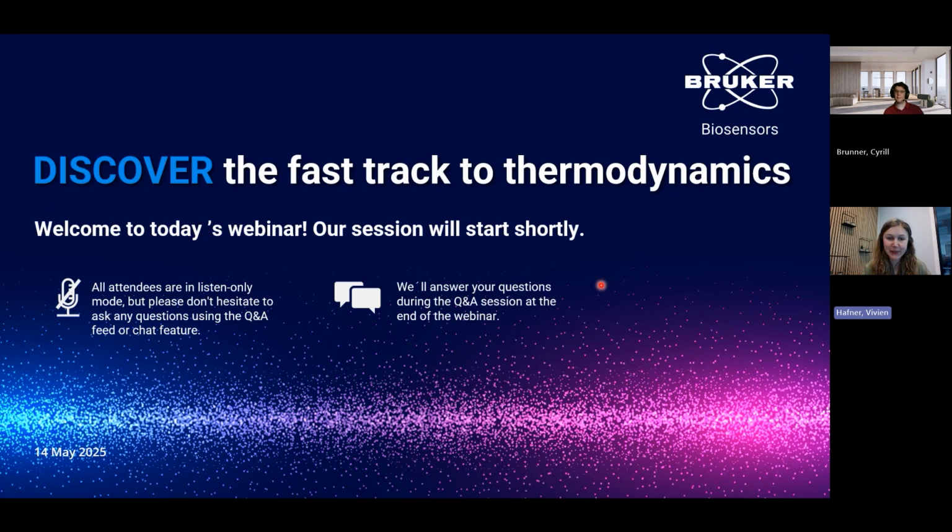Each month, we explore a different molecular interaction, discuss its challenges, and discuss ways of analyzing it. Today is a very special episode of this webinar series, because this is the first episode that is focused on SPR, as the Bruker SPR team and the Dynamic Biosensors team have now merged, and we cover all the different technologies from high throughput SPR all the way to kinetics on cells. Today we will explore the importance of thermodynamics for the drug discovery process, and how to perform a thermodynamic profiling using SPR.